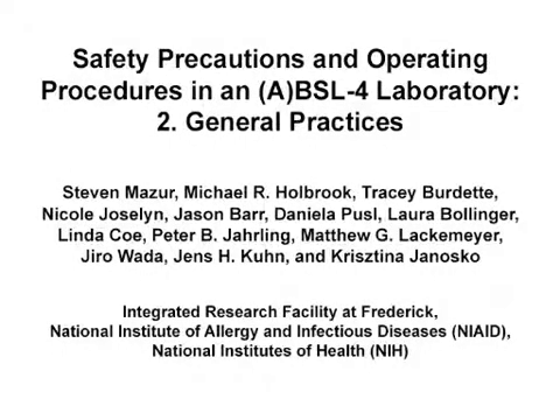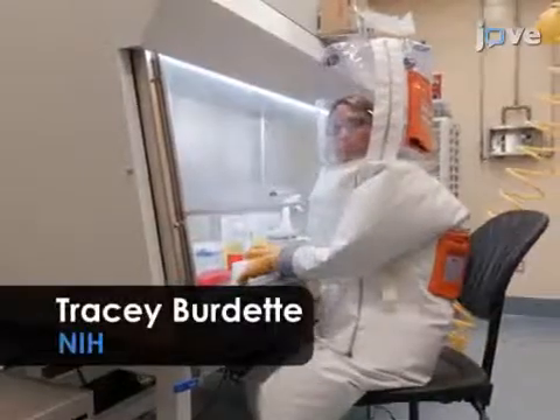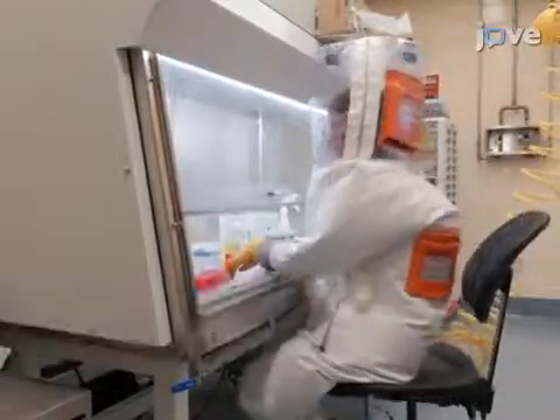The overall goal of this procedure is to demonstrate safe practices when working in a biosafety level 4 suit laboratory, using the plaque assay as an example. This procedure demonstrates the modifications necessary to perform a standard plaque assay in a biosafety level 4 environment. Demonstrating the procedure with me will be Tracy Burdett, a technician from the Integrated Research Facility.